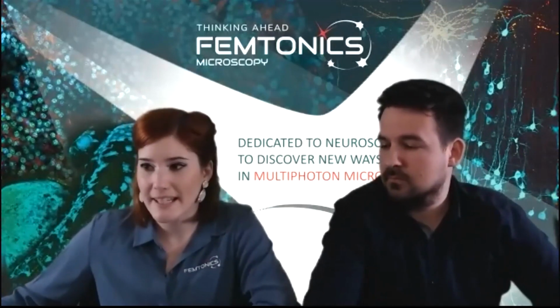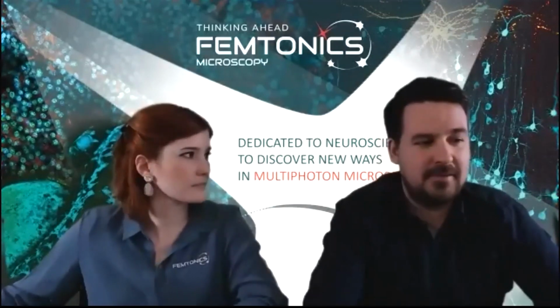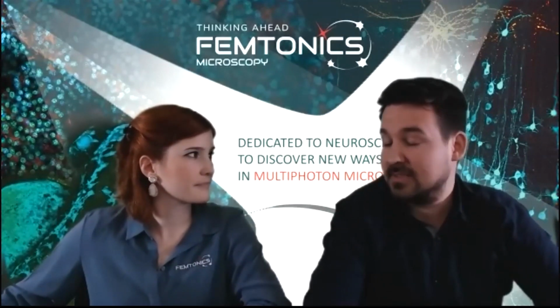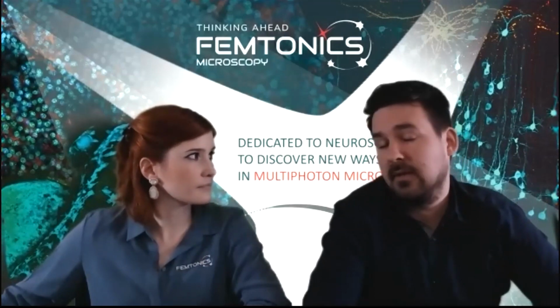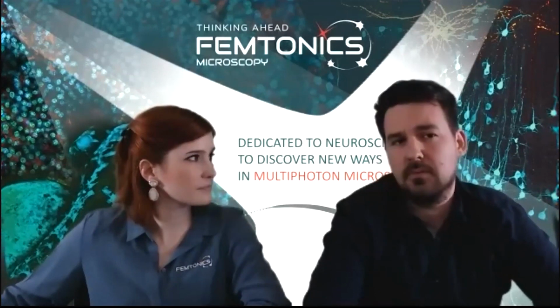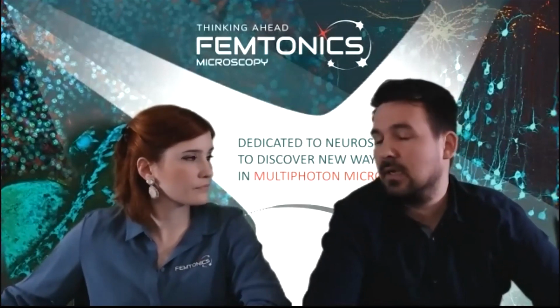Pretty easy. What is the depth that can be reached with a FEMTOSmart system? Well, I think it depends on many parameters. For example, the sensor and the objective, and of course the surgery technique. But I can say that in case of cortex imaging, you can go up to layer 5 neurons. It can be easily seen.